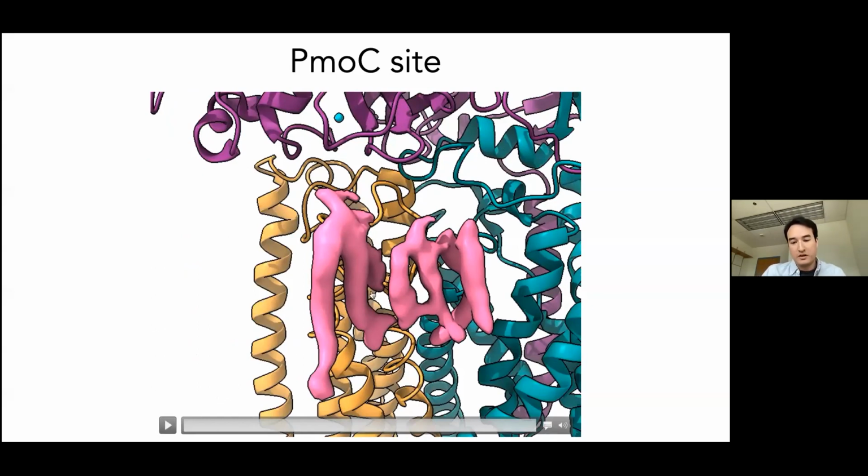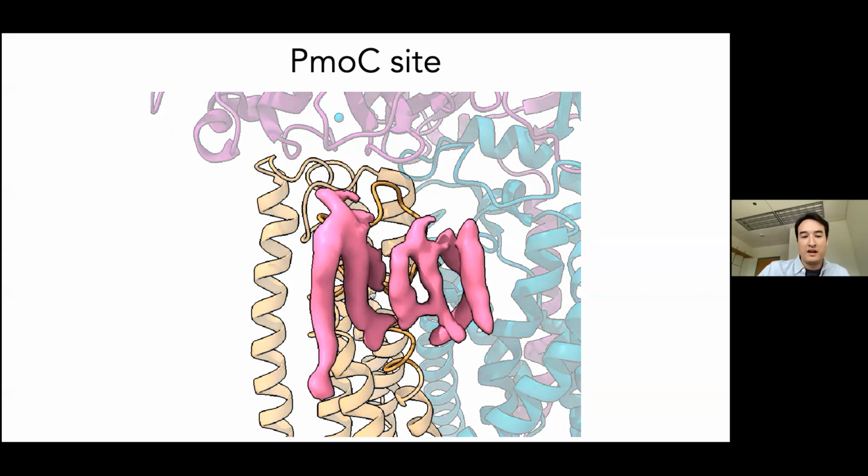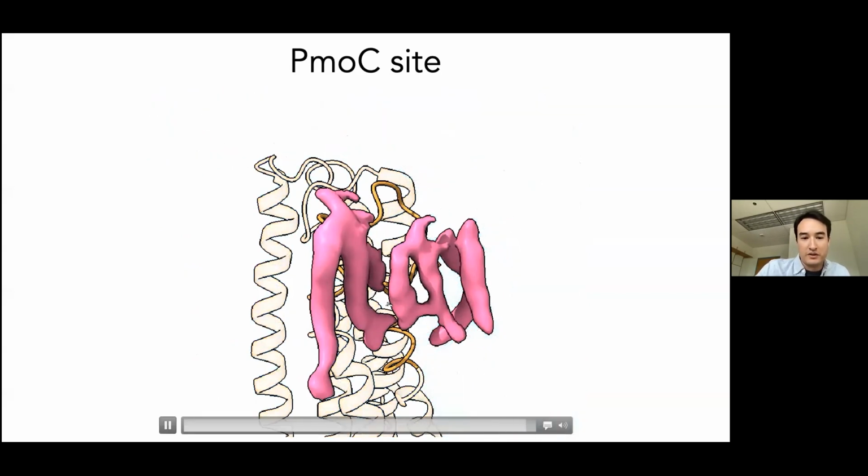And what's really critical for this cryo structure is if I now hide the A and B subunits and just look at the C subunit, what I've highlighted here is that highly conserved region that I was mentioning before. And we can see just how this highly conserved region is abutting the membrane layer and the role that the bilayer is playing in folding this region.